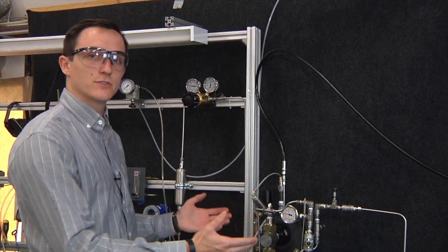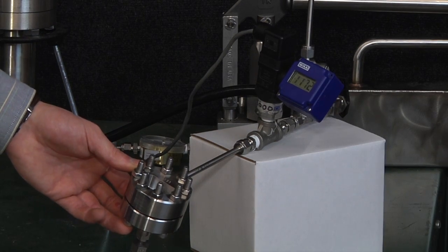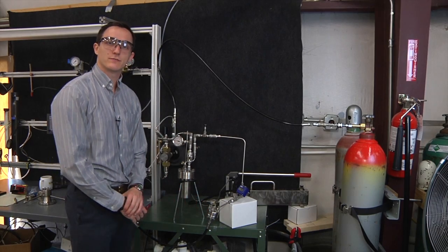Today I'll be showing you our Equilibar supercritical extraction setup, which highlights our newest piece of technology, the BR-1, which stands for blockage resistant regulator.